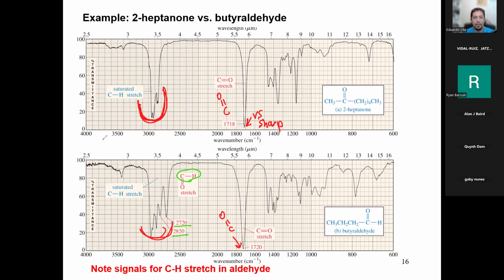So you're going to ask me, I'm going to use the color green, well, what's all this? I don't know. Probably some CH bends, probably some wags. What is this? I don't know. That's in the fingerprint region. We don't really look at it. What about these? I don't know that there's much else to really look at. So this is again probably some CH bends. You can just say they're bending vibrations.